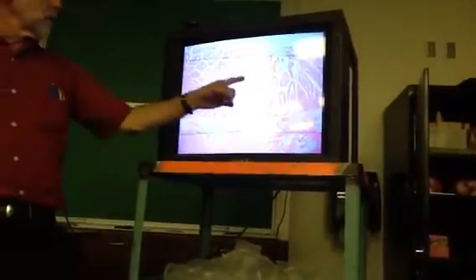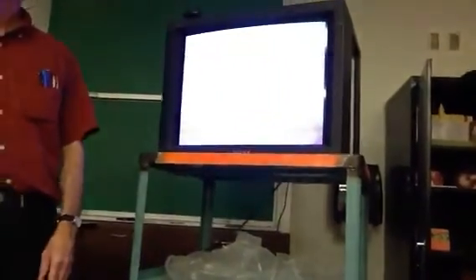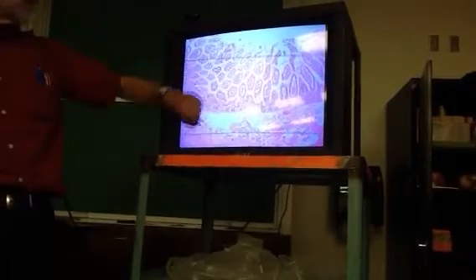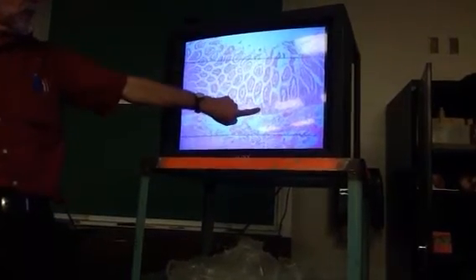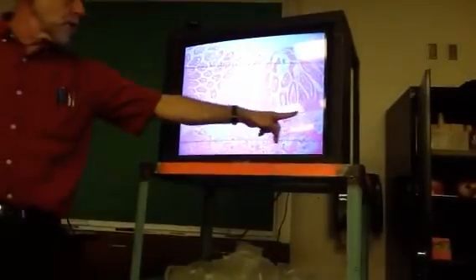Okay. This on the edge, is that the serosa here? This is what you're looking at right now? No, that's going to be below the mucosa. Below the muscularis. See, where we are right here is in our mucosa. So we were looking at the edge of one of these, seeing the brush border. And that's the mucosa then. This is from here up. That's all mucosa. We've got villi, we've got intestinal glands, we've got lamina propria, and then here's our muscularis mucosae along the bottom here.